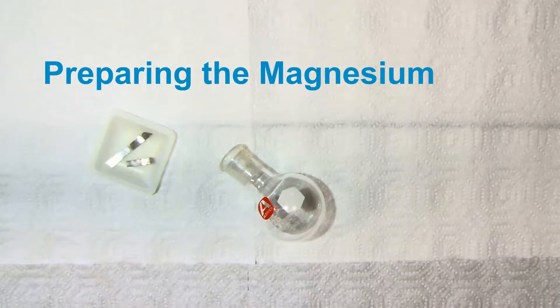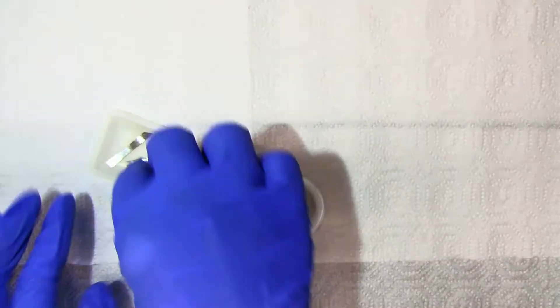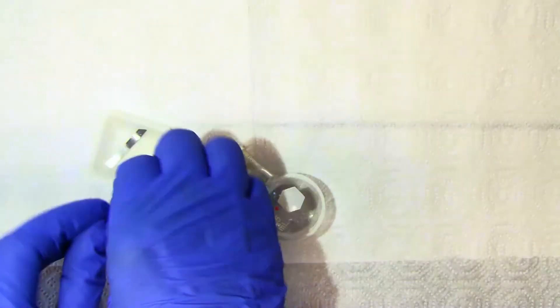The magnesium we use has been freshly sanded to expose a more reactive surface. So do not touch it with your bare fingers or you'll contaminate it or get moisture on it. To fit the magnesium into the bottom of the flask under the liquid that will be used, it's a good idea to curl the magnesium you have weighed into a loose ball or two, like this more or less.